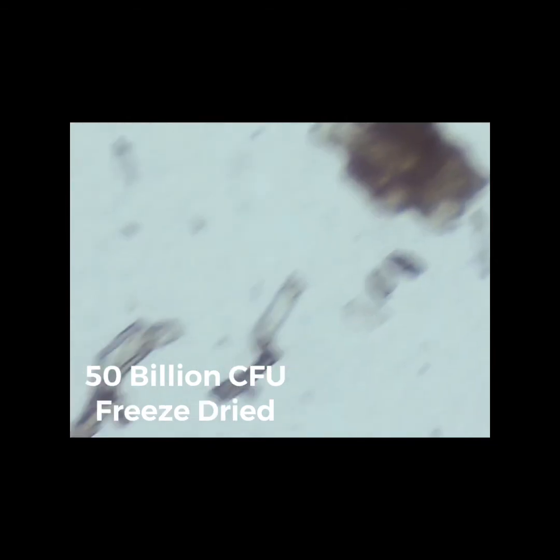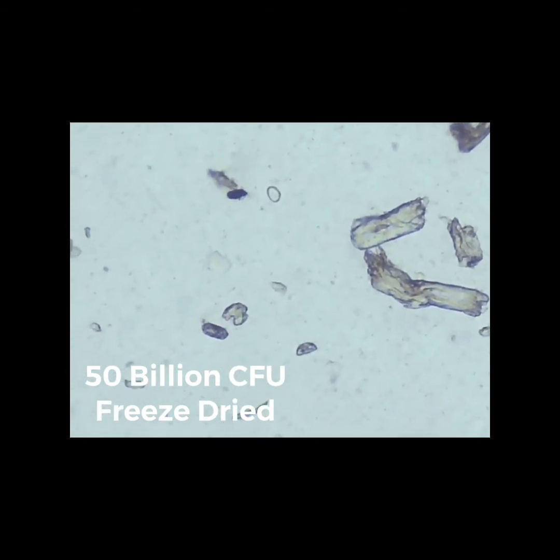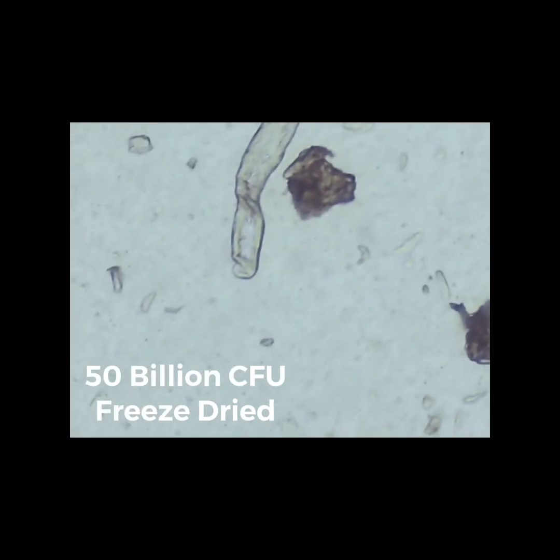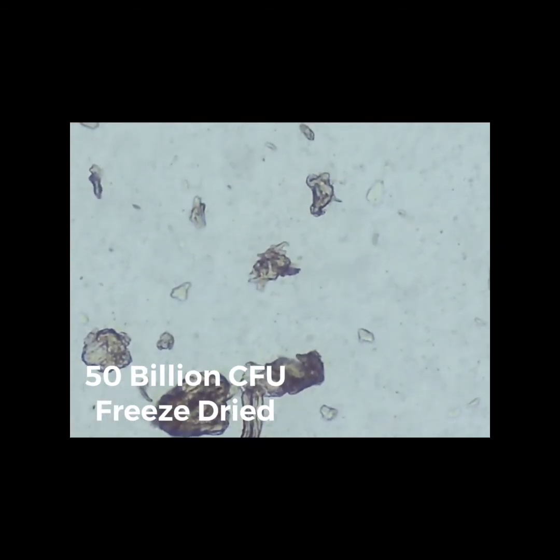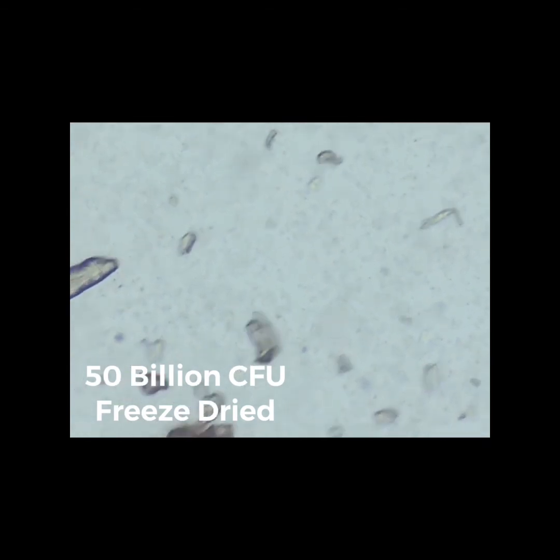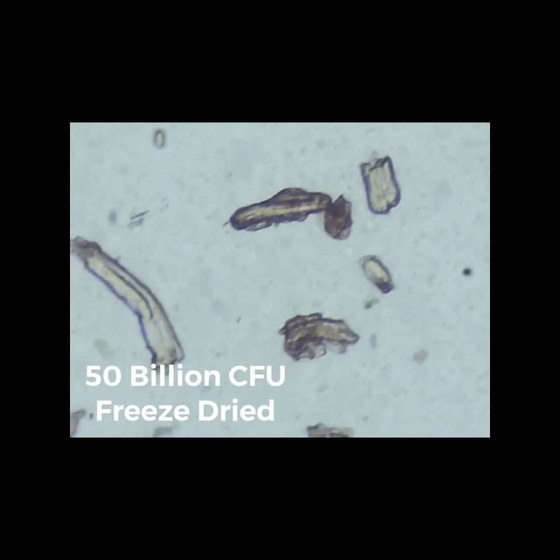We move it around — more dead cells, dead cells, dead cells and debris. Nothing moving, nothing pulsing with energy, pulsing with light, pulsing with movement. It's all dead material. The label says you're getting 50 billion CFU. There probably at one point were 50 billion CFU, but I don't see anything living at 40x magnification versus 40x magnification with Your Biotics. We'll just continue to scroll around — it's just dead material.